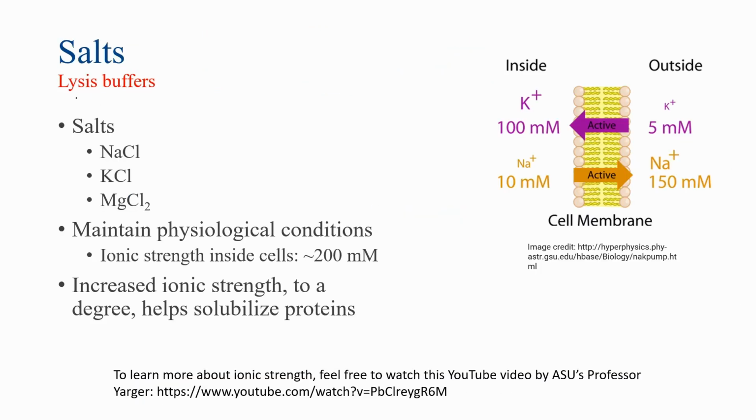Now, it's important to understand that in the case of lysing a cell, it's important to have a lysis buffer that has the necessary components to not only lyse the cells, but also ensure that the lysate is within a suitable environment that allows for further and subsequent experimentation. So we said that lysis buffers can be categorized into either detergent lysis buffers or non-detergent lysis buffers. In the case of detergent lysis buffers, we have detergents that assist in lysing the cell. And in the case of non-detergent lysis buffers, we utilize other means to lyse the cell membranes, for example, by having a hypotonic solution.